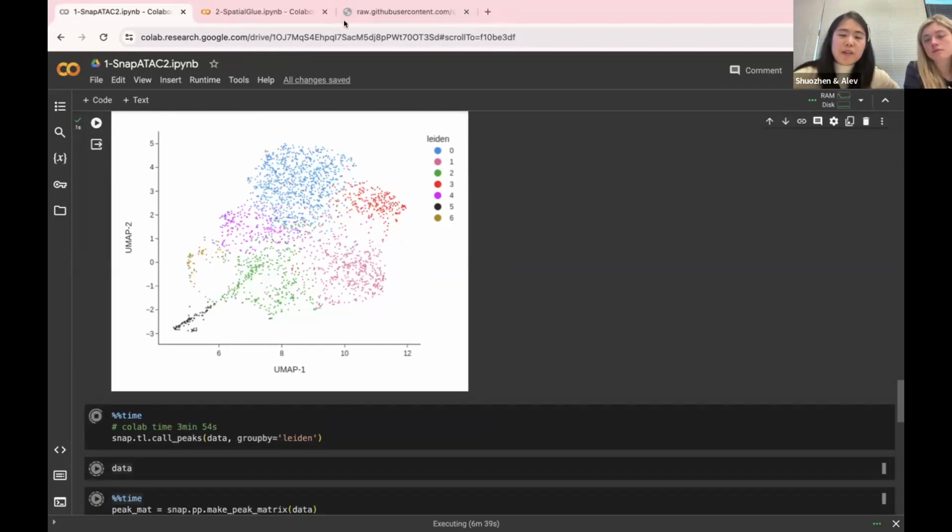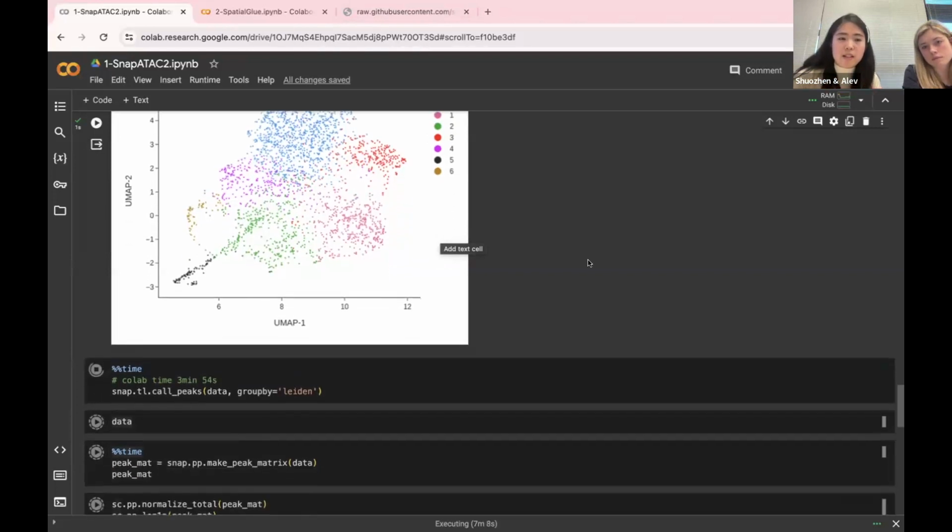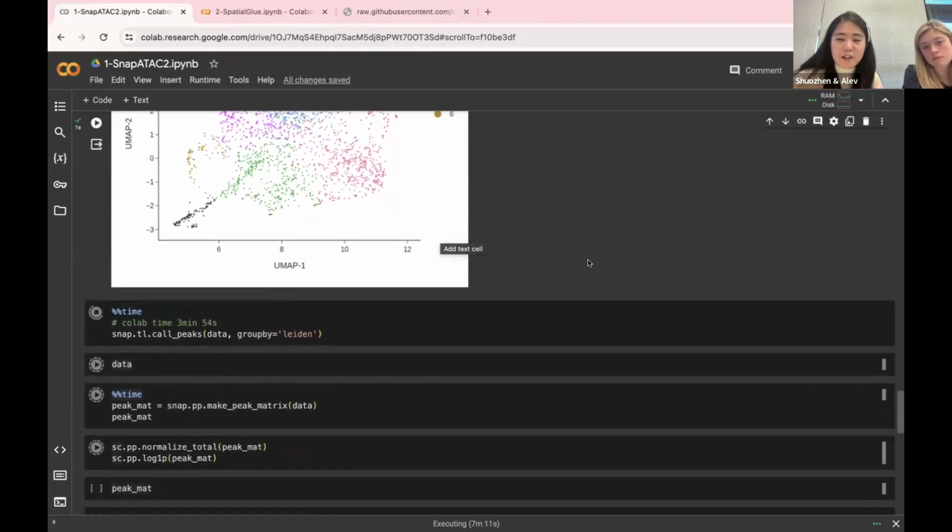So the mapping back to the spatial location. If you recall the first part of this hands-on workshop, we introduced two different methods, either manual selection or software, to select those tissue locations that actually have the barcode flowing through them. And then we generate the spatial folder containing that information. While we are doing the downstream analysis in the later half of our workshop, we will use the information within that spatial folder and add that into our data structure, into our AnnData.